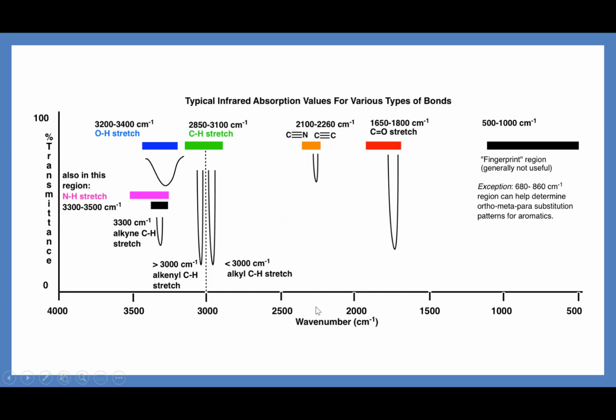And what happens is we end up with a spectrum like this. It is like a graph: on our x-axis we have the wave number and on our y-axis we have transmittance, which is measured in percentage. What I want you to notice this time is that, unlike our fluorimetry and our UV spec, where our baseline is usually down the bottom, for IR our baseline is actually on the top. We'll start to look at that a little bit later.